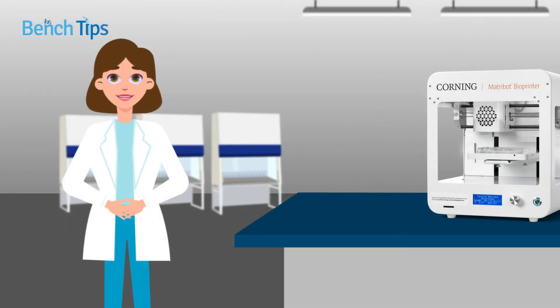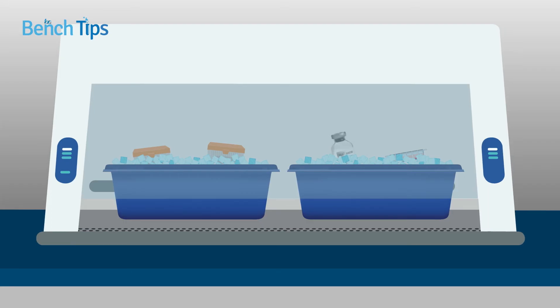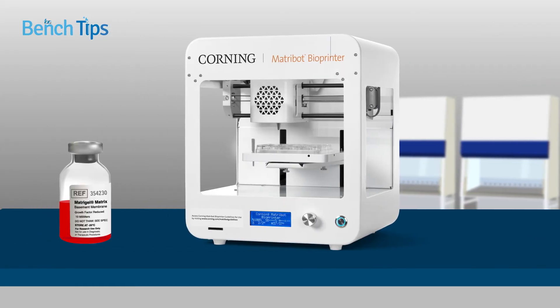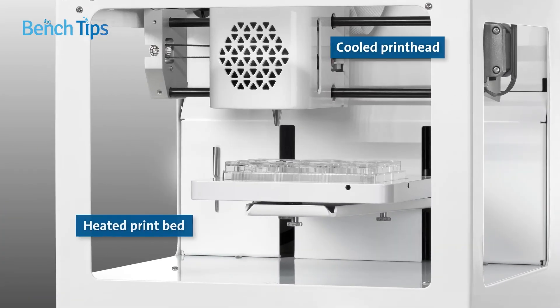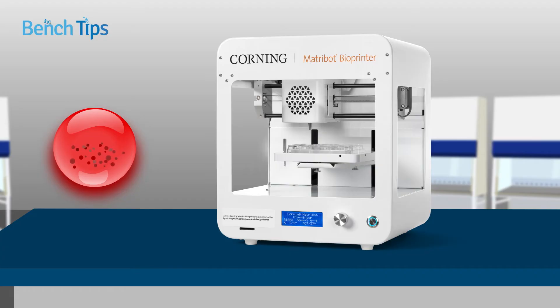Bioprinting doesn't need to be difficult. Instrumentation has been developed to overcome many well-recognized problems. For example, the Corning Matribot bioprinter was designed for use with temperature-sensitive hydrogels, such as Matrigel Matrix, which can undergo premature gelation if handled incorrectly. Manually dispensing these types of materials usually involves using multiple ice buckets to keep the hydrogel and any pipette tips chilled. By incorporating a cooled syringe printhead and a heated print bed for extrusion-based bioprinting, the Matribot bioprinter ensures that the hydrogel sets only once it reaches the culture vessel.